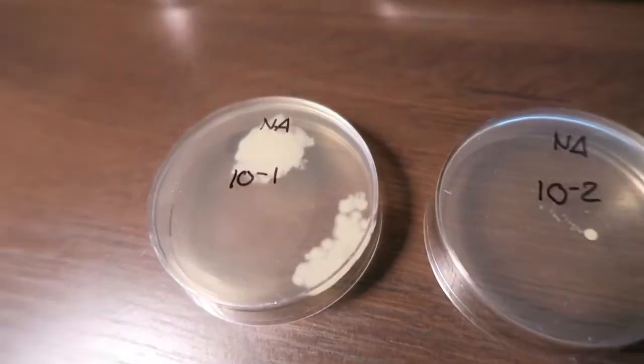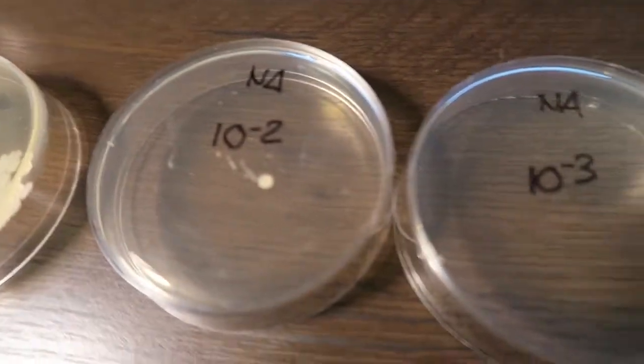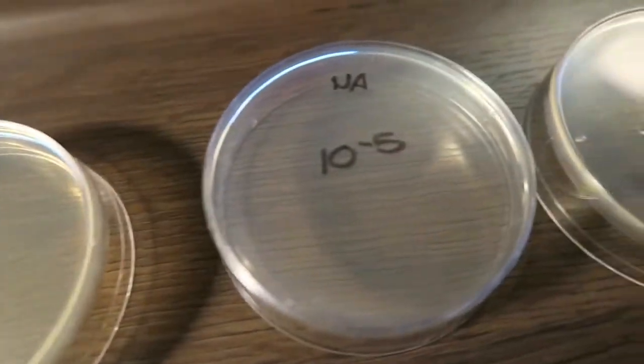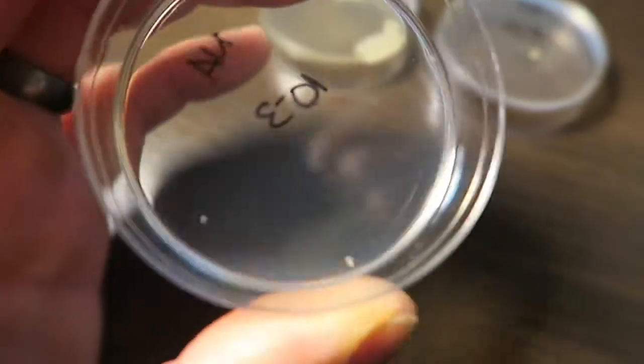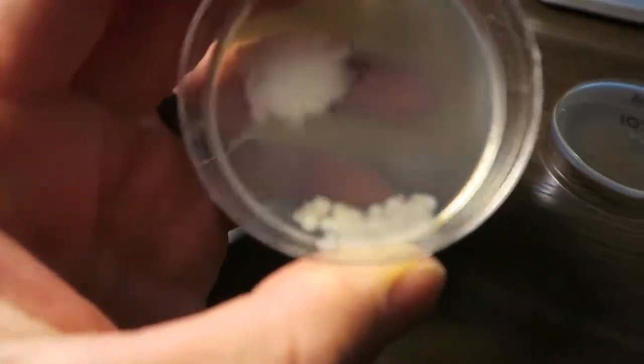So here are plates one, two, three, four, five, and six. I think there's like one microorganism over there and another one on the other edge right here. And then just a couple on plates four, five, and six. I don't know what happened here.